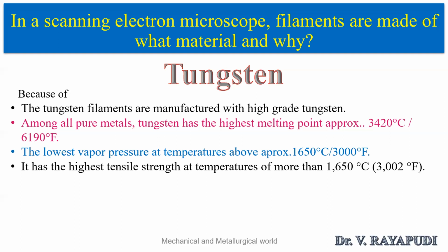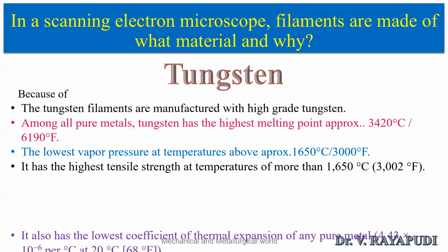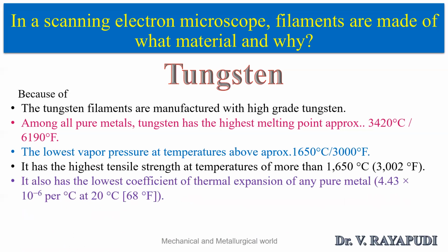So it can be converted into wires at high temperatures, and it can give the highest tensile strength. And another property is that it has the lowest coefficient of thermal expansion of any pure metal. If you compare with any pure metals, it has the lowest coefficient of thermal expansion. So the filament should have the lowest coefficient of thermal expansion.